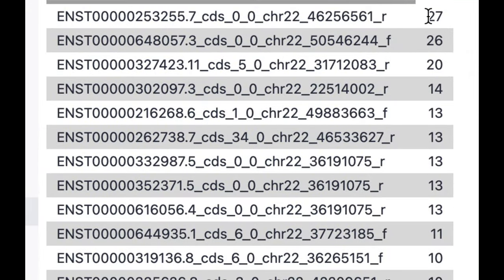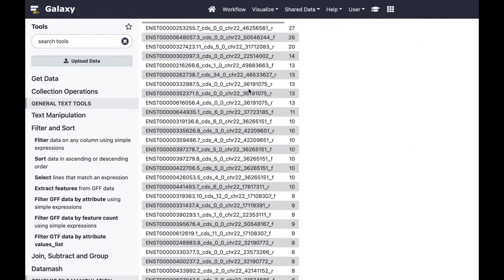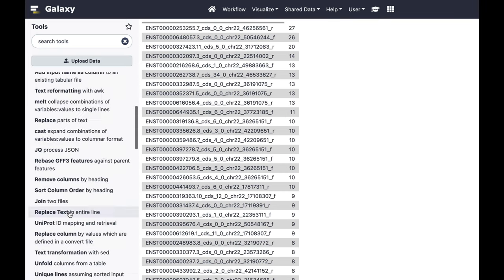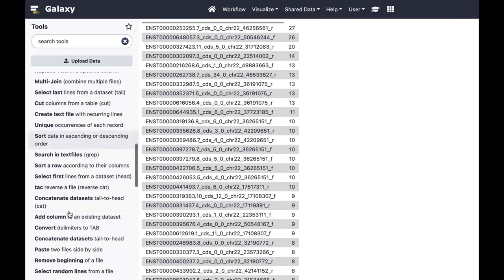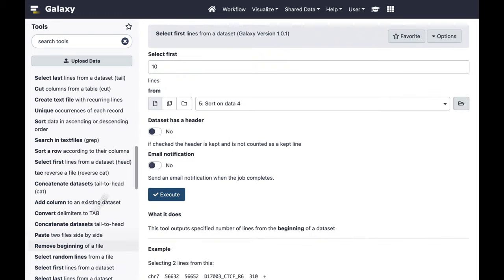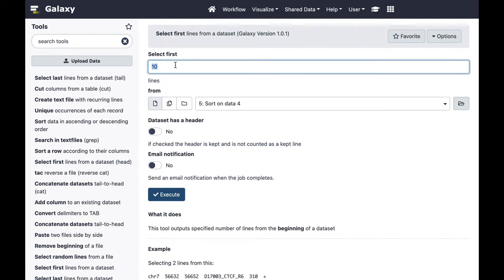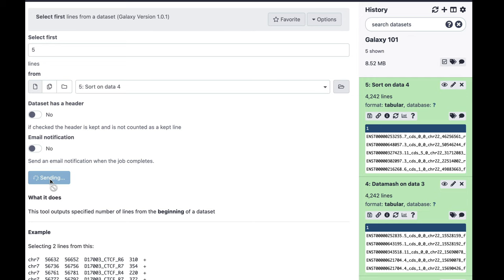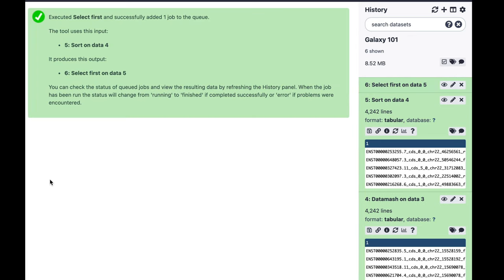Now the dataset is sorted. The winner is the exon with 27 snips in it. Let's restrict this dataset to just the top five exons. I'll go to Text Manipulation and select 'Select First', which selects the first lines from a dataset. I'll tell the tool to select the first five lines from this dataset and run it.